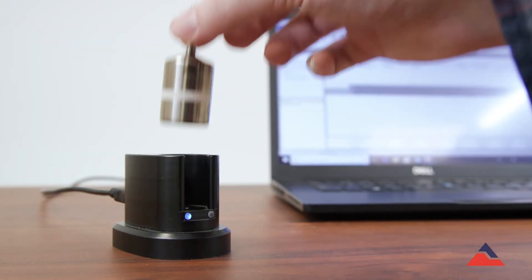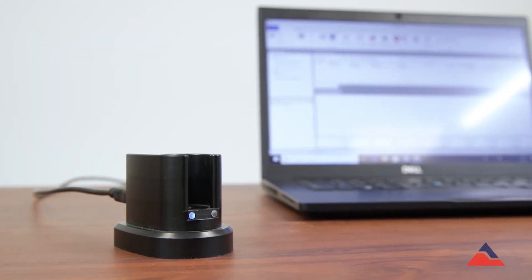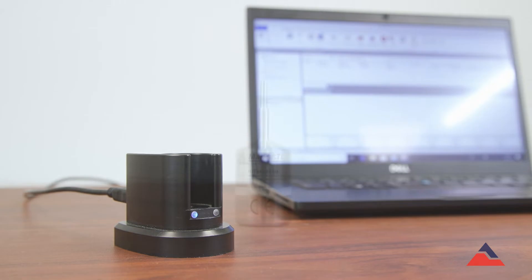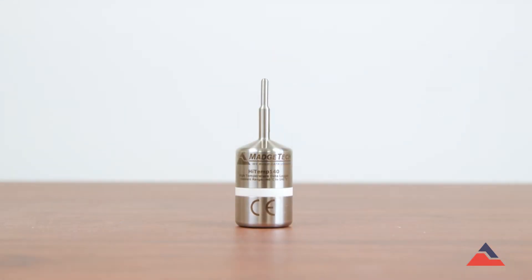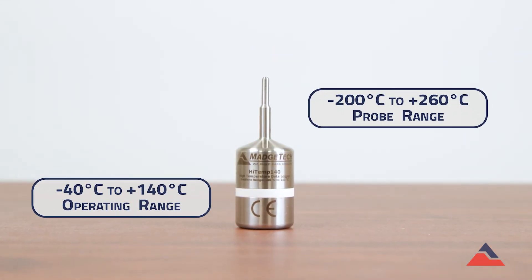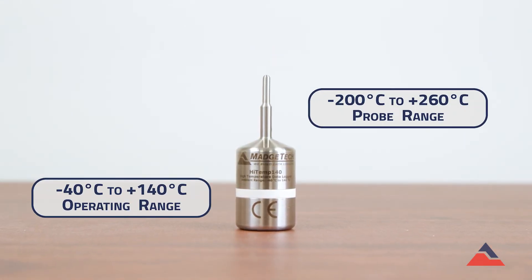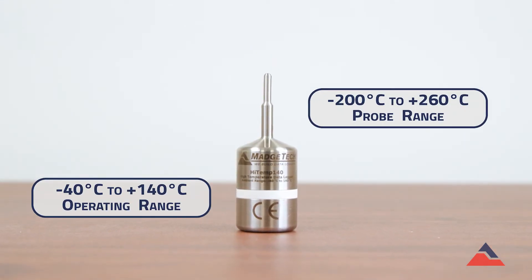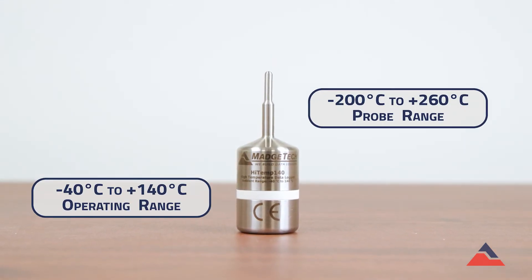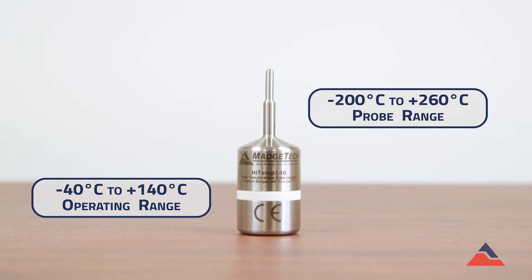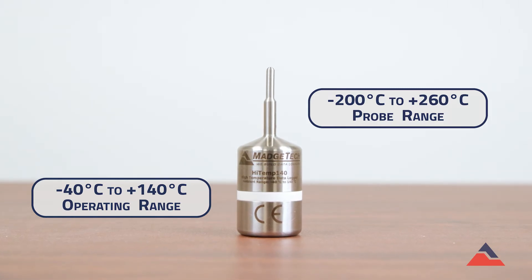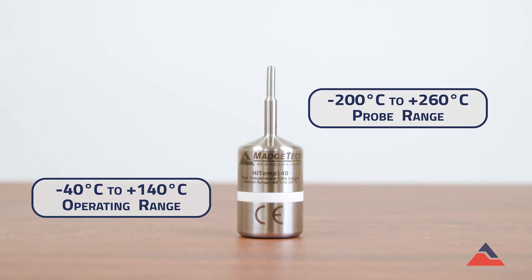You may now disconnect the logger and place it in the study environment. Remember that while the probe has a large temperature range, the body cannot exceed 140 degrees C unless using a thermal barrier, which is sold separately.